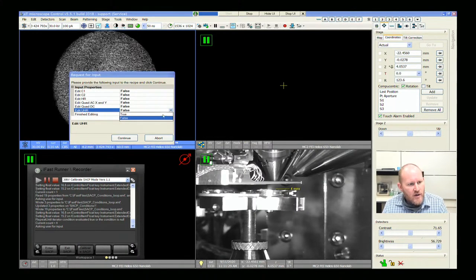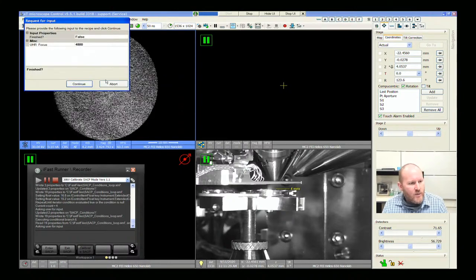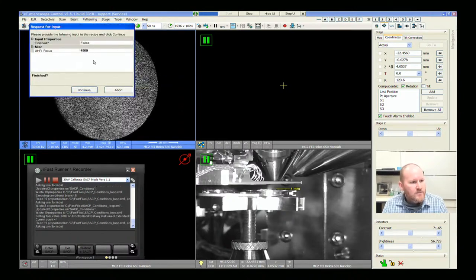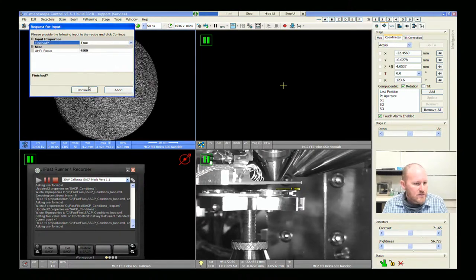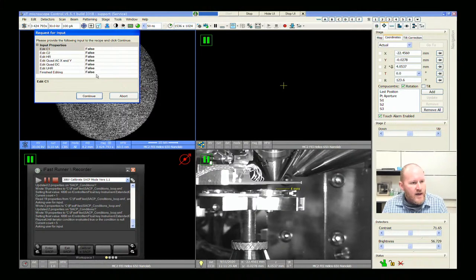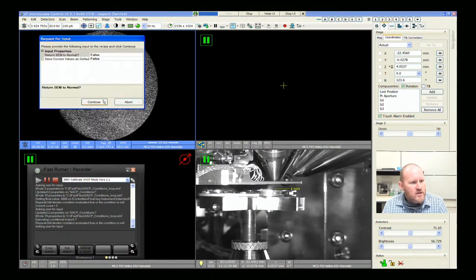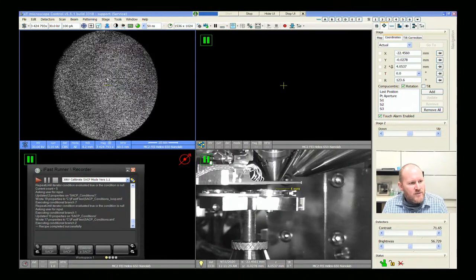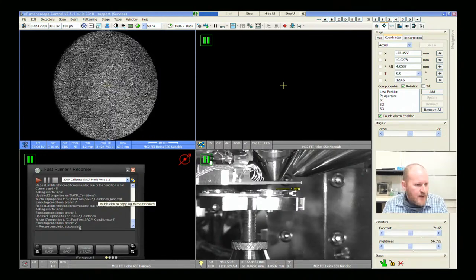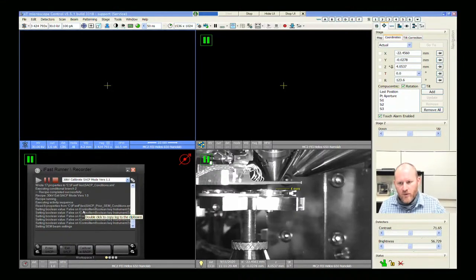The UHR we're going to leave at a predetermined value — we just always use that value. So we're finished editing all of this. I'm going to continue and return the SEM to normal. I'm going to save these values as default so next time I run this script, that's where it will be. Now I can say exit SACP and we're going to go right back to normal imaging mode.